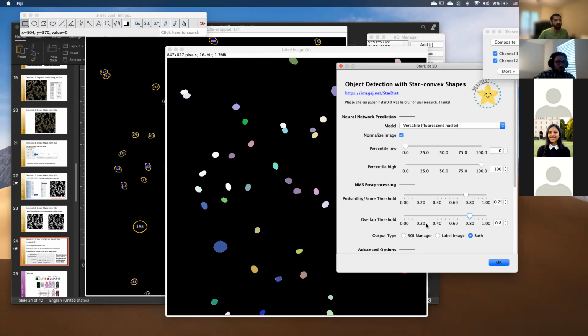So go ahead and play with this. This was not very clear with a very complex data set like lung, but with a simple data set like 2D cells, this is much more clear, right? So go ahead and play with this.